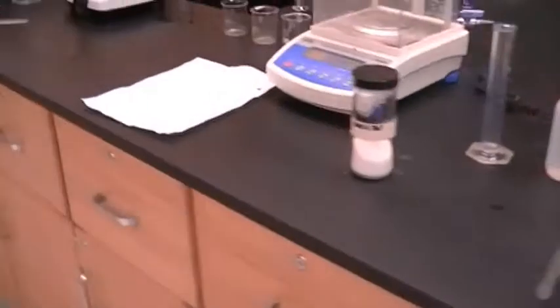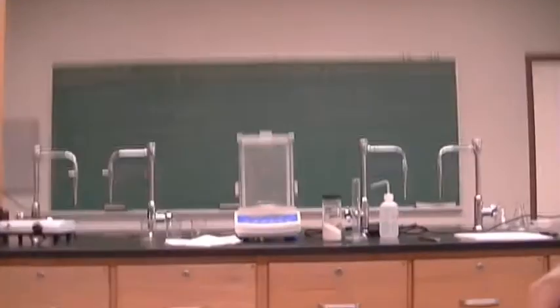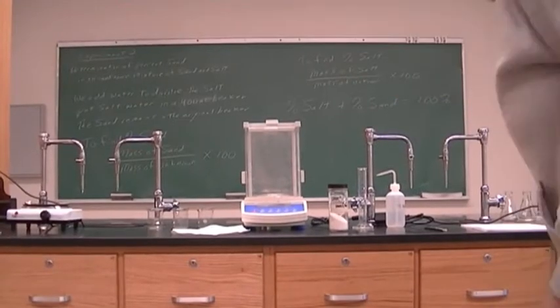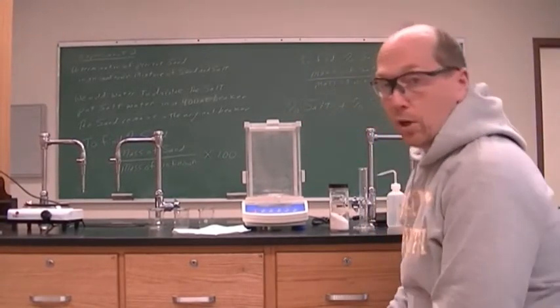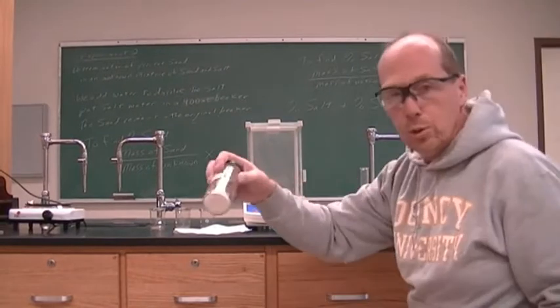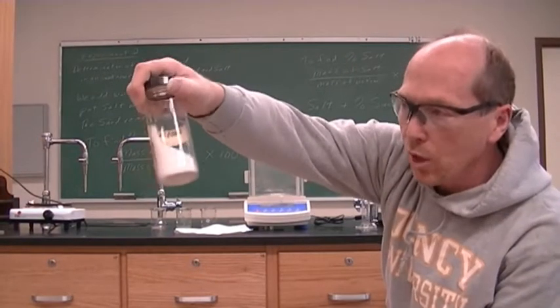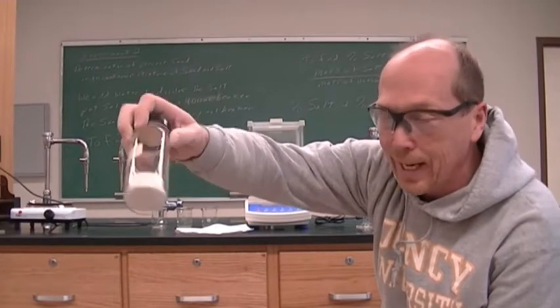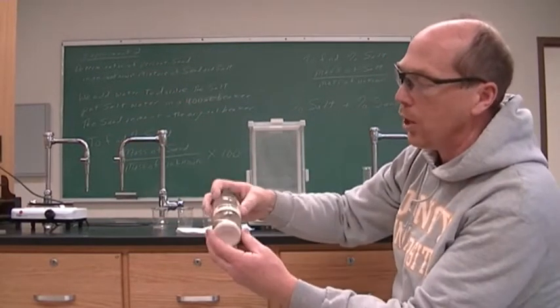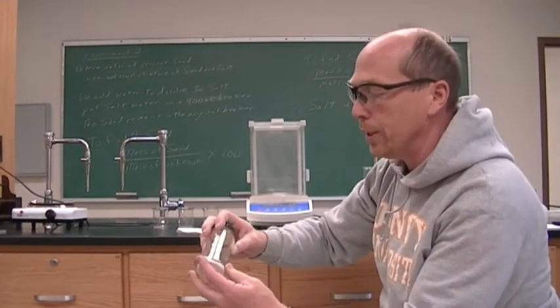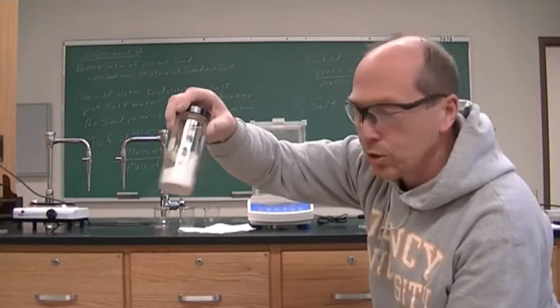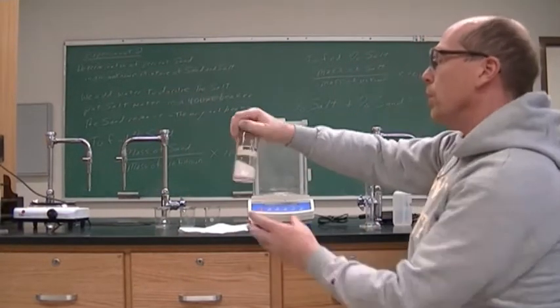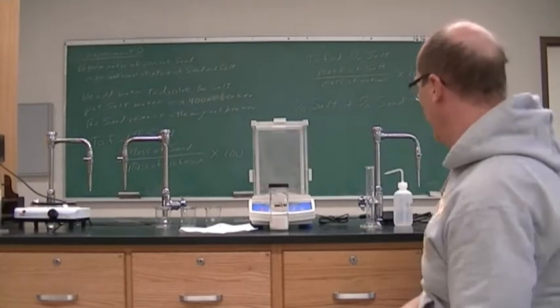We are going to begin our experiment. We have our sand-salt unknown. You can visually look at it — the salt is white and the sand is also white, so it is very hard to determine if there's more sand or salt. We are going to have to calculate it.